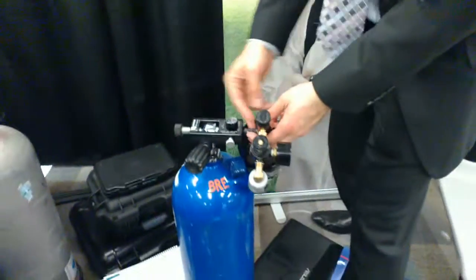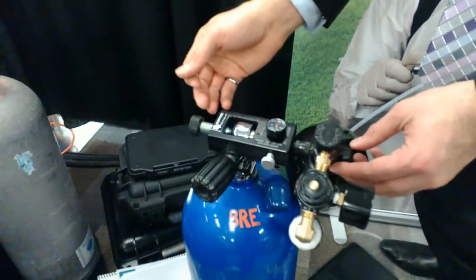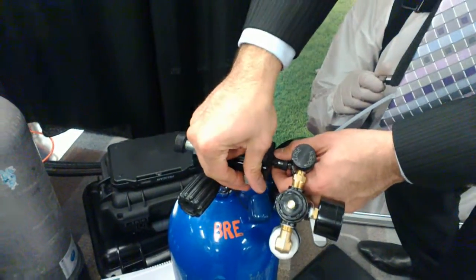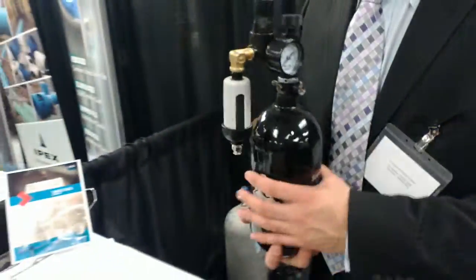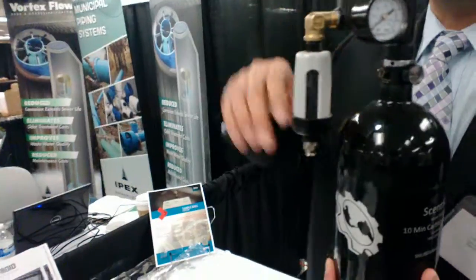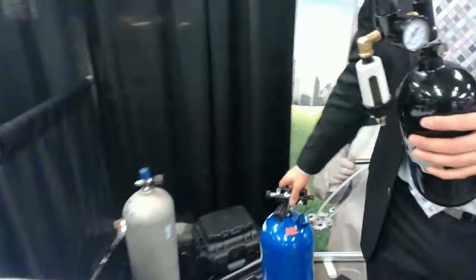So here, we're connected to our tank. This tank is just a normal scuba tank with an adapter that we sell. What you do is you just open it up and the air will go into this tank. And then once it's full, close it up, release the pressure, and in a couple of minutes you have a full tank. You can do 20 normal samples with just the air inside this bottle — it's 15 minutes. Each sample takes between 30 seconds to 1 minute.